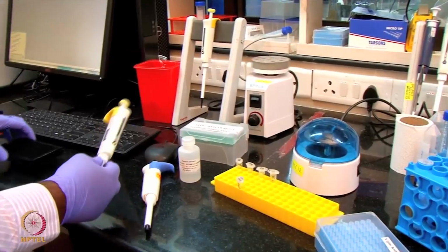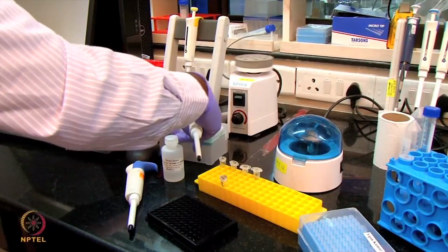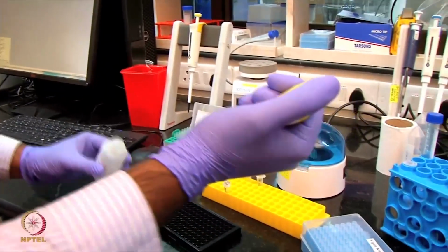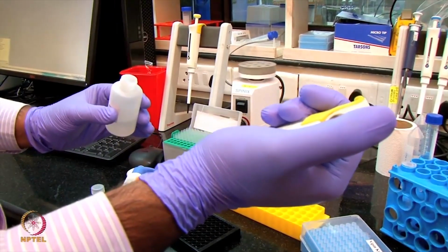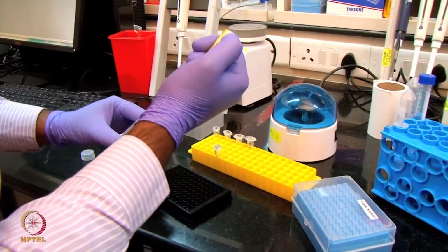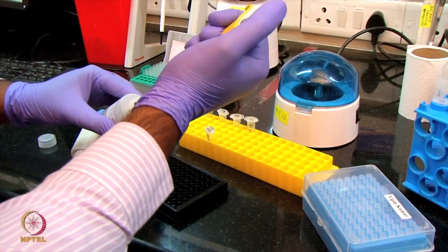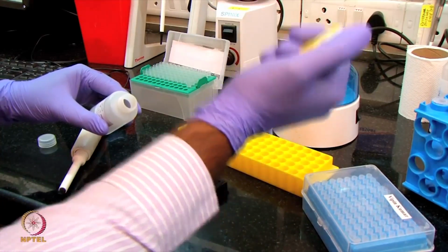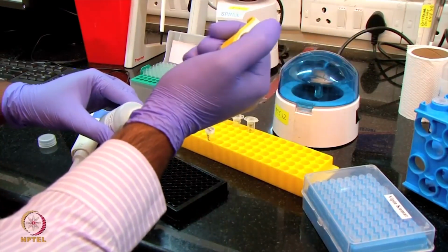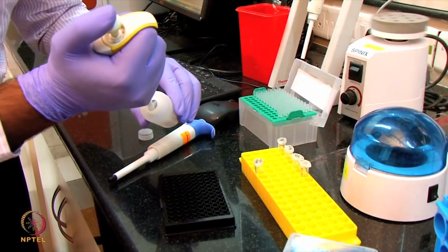Prior to that, I'm taking this 96 well plate and adding the buffer into the wells. I'm going to use around 6 concentrations, two-fold dilutions. So I will add buffers here and do the dilution in the plate itself. 200 microliter each of the sample diluent buffer I'm placing in 6 wells of the 96 well plate. I'm going to use 3 wells as references, just plain buffer used as a reference.